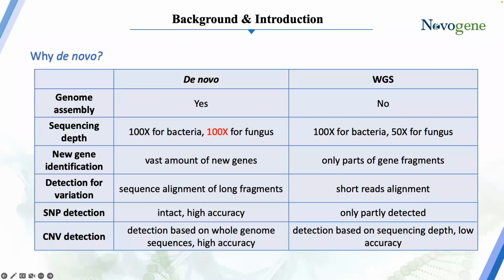So very briefly, I want to go over one of the caveats I kind of stated in the beginning of this section. The whole genome sequencing that we've been covering up until this point stipulates the existence of a reference genome, right? Having a reference genome makes everything a lot easier, right? If you have a reference, you can take relatively short reads from the Illumina platform, map it against that reference genome, and have pretty high confidence that you're looking at a gene that is already known, and compare the variation in those reads versus that reference, right? But what if you don't have a genome, right?